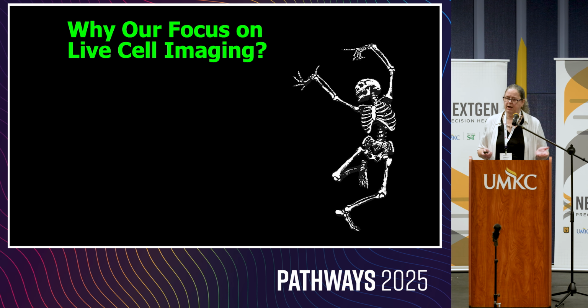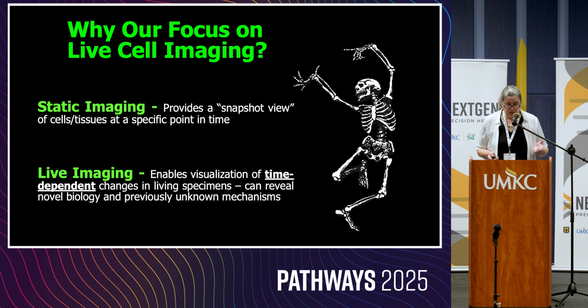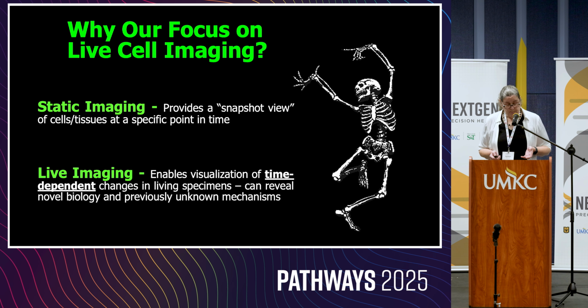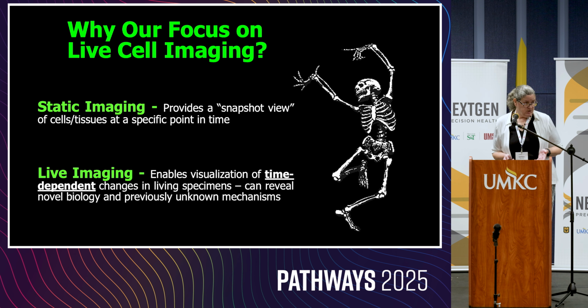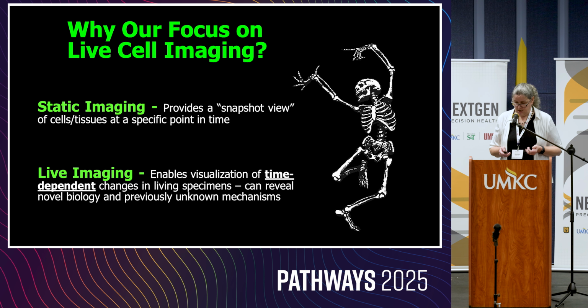So you might ask, why our focus on live cell imaging? Well, static imaging provides you a snapshot view of cells and tissues at a particular point in time, but live imaging enables us to visualize time-dependent changes in living specimens and can reveal novel biology and previously unknown mechanisms.